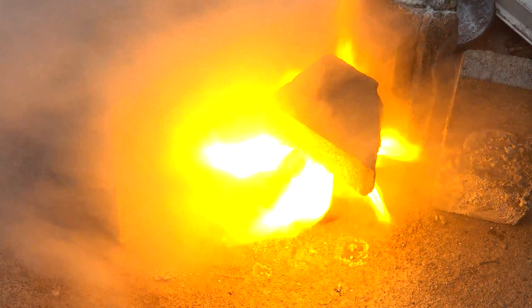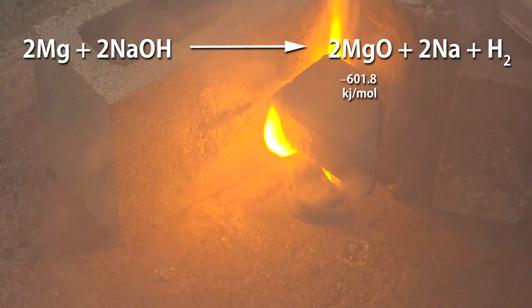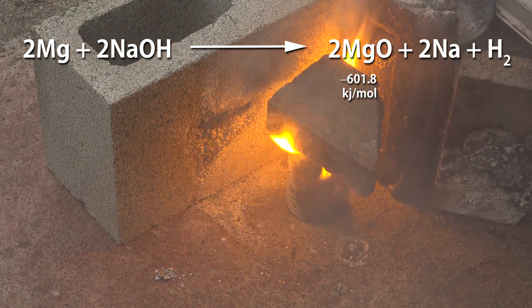Now it might seem odd that we're using a less reactive metal like magnesium to make a highly reactive metal like sodium. Usually it's the other way around. This works because the enthalpy of formation for magnesium oxide is very high.